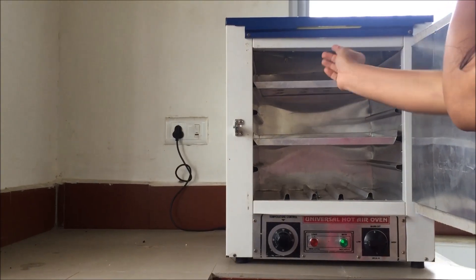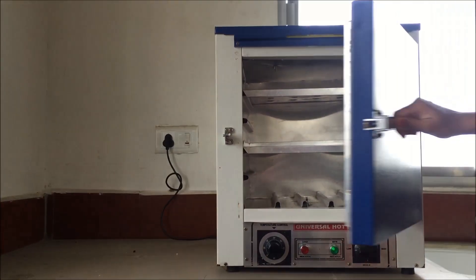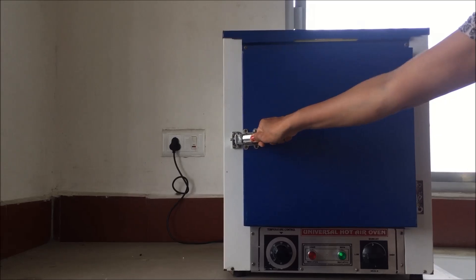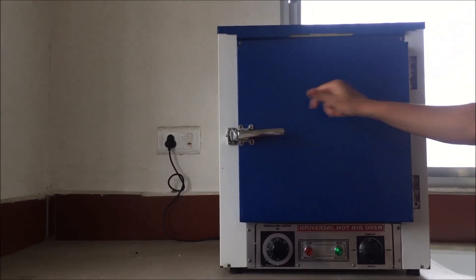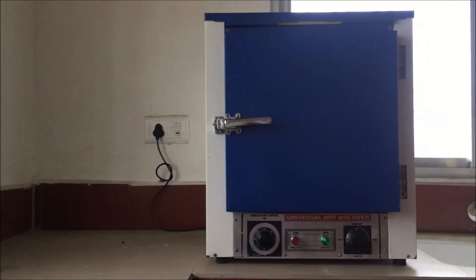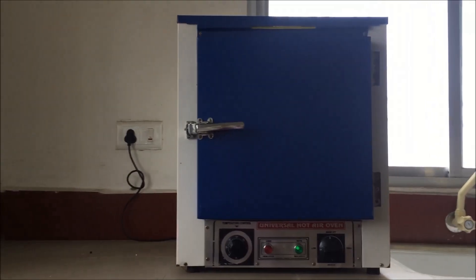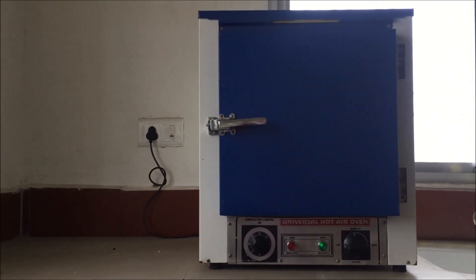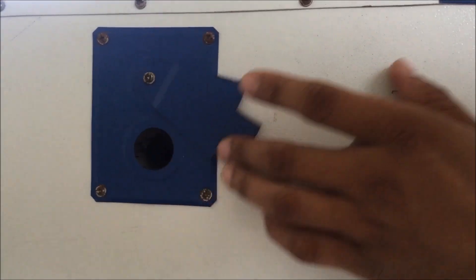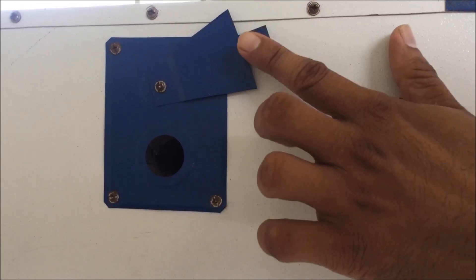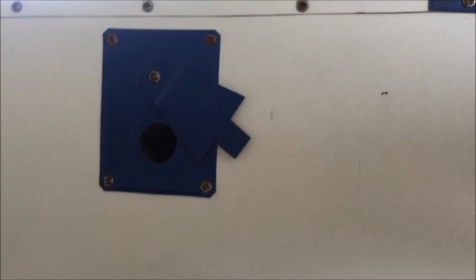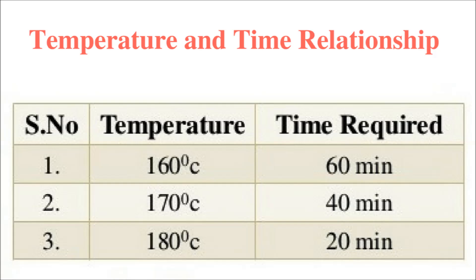This is a special knob to open and close the door accordingly — it is unidirectional, only allowed to open one way. Let's place the tray back in its original place. Now we see the two vents as seen inside. Let's look at what these are on the outside of the hot air oven. There are two vents — one on the left side and one on the right side. They can be opened or closed accordingly, and they allow vapor to escape.